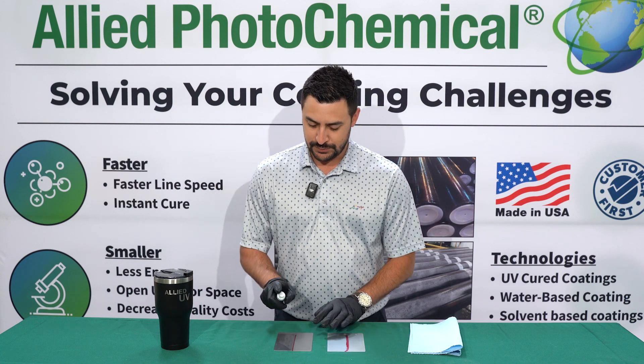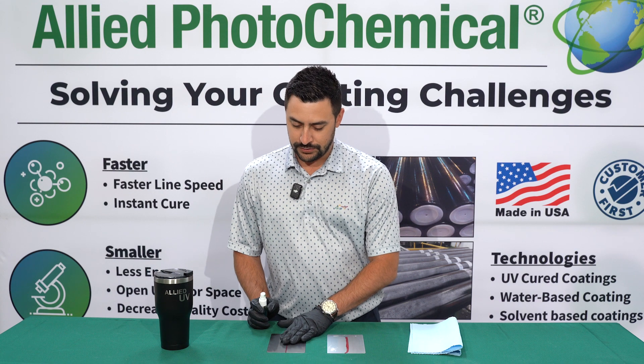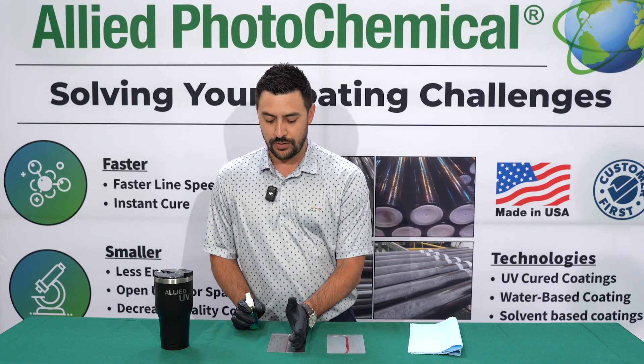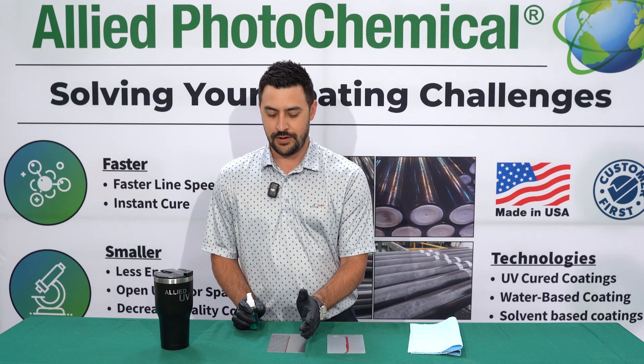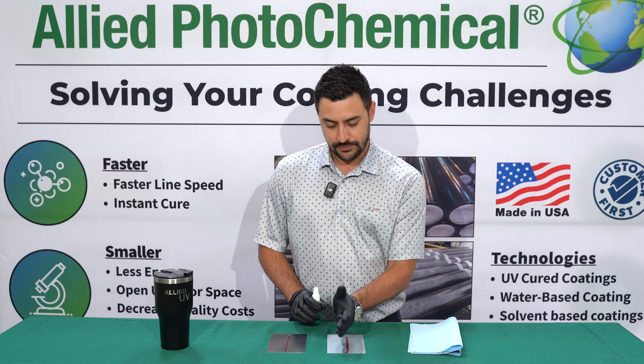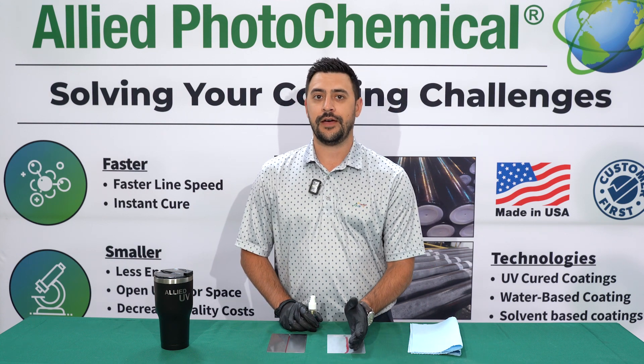I'm going to go ahead and just spray right down the middle where this line is. On the metal products, you'll notice that the copper sulfate will stay blue on the coated section and it'll turn a brownish amber coppery color on the uncoated section. For the galvanized portion, copper sulfate will stay blue on the coated section and it'll turn black on the uncoated section.